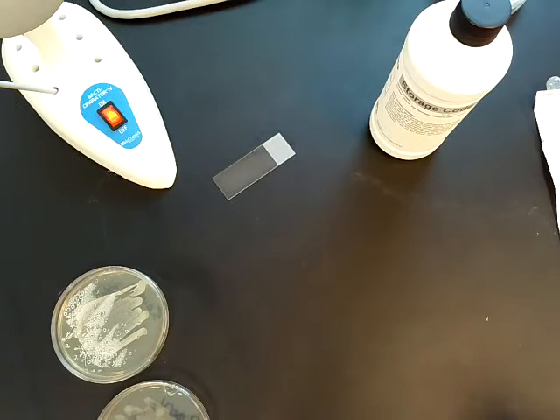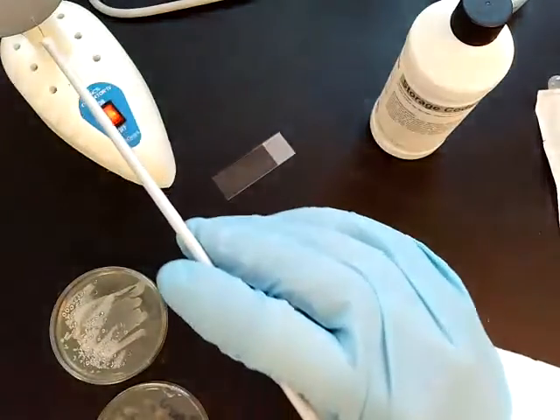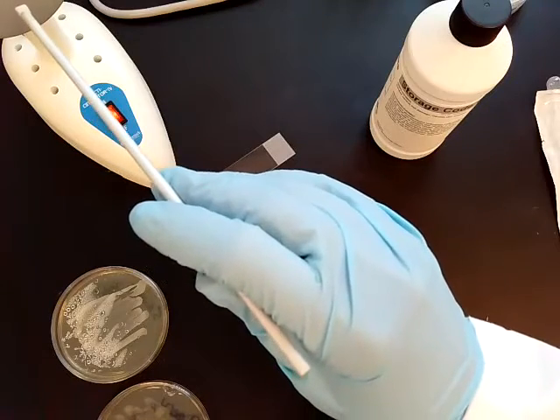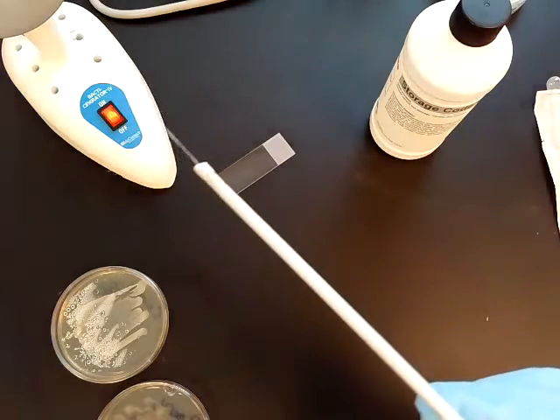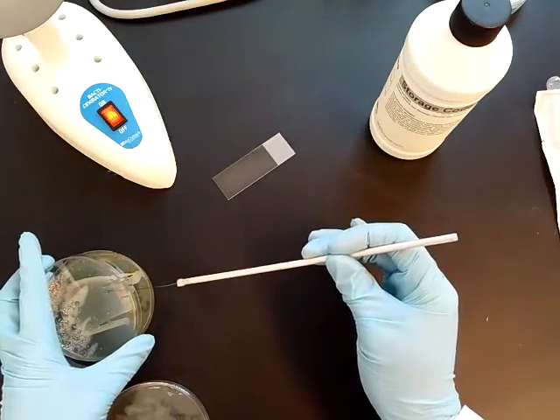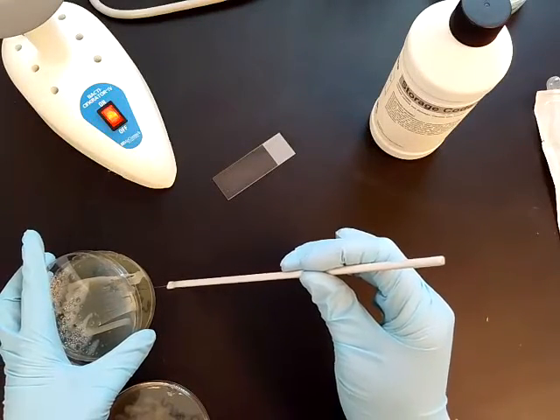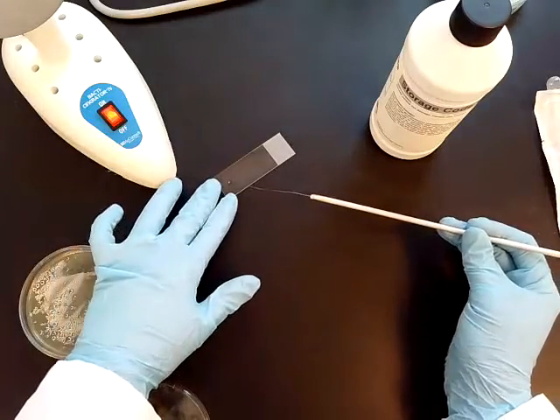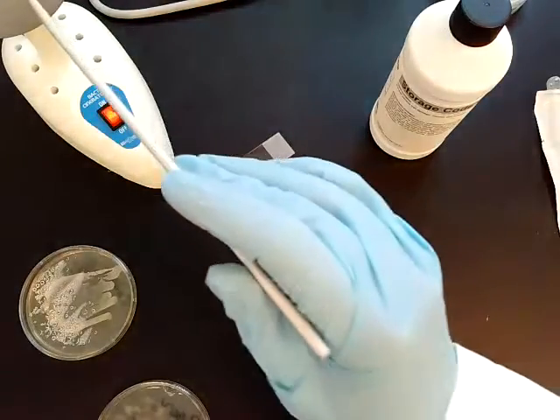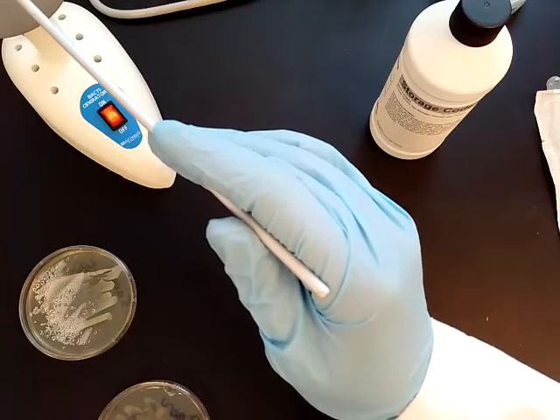So to test for the presence of this enzyme, we do a simple transfer of bacteria to a microscope slide, and then we're going to evaluate that microscope slide for the presence of the enzyme by adding hydrogen peroxide to it. So we start by sterilizing the loop, and then we're going to take a small amount of bacteria and add it to the microscope slide. So it's just a dry microscope slide, and we're going to smear some bacteria around. Now I'm actually going to do two different species next to each other so that you can see two results.